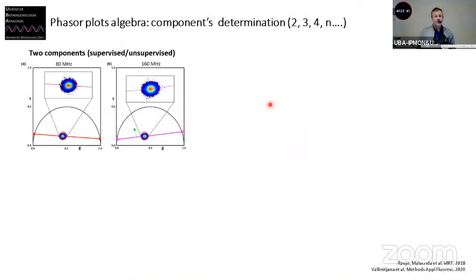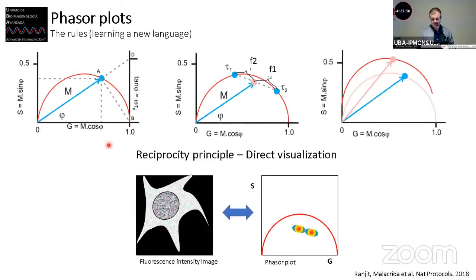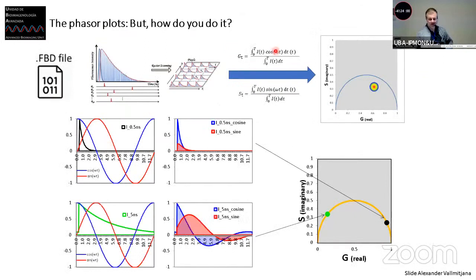But with the Phasor, we can obtain quantitative information of our lifetime even when we don't know the lifetime that we have in the system. If we have our system calibrated, and we calculate, let me go back to here, not the first harmonic, but the second harmonic.